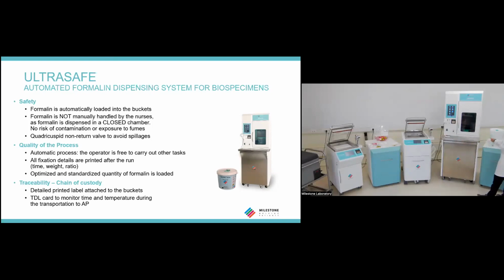Now I will make a practical demonstration for you. I will scan the ID of the bucket for traceability. Also here we document everything. The ID of the case is present. Now I will insert the bucket. I close it and select the program. And then, automatically, the bucket will be loaded with a fixed and standardized quantity of formalin.